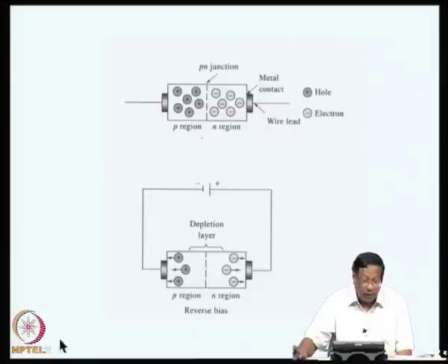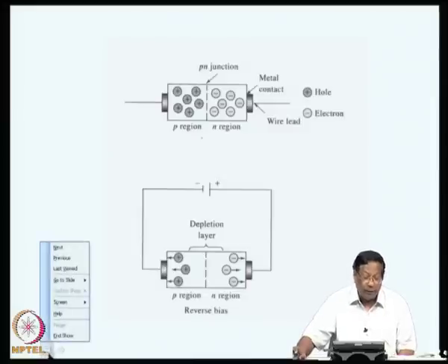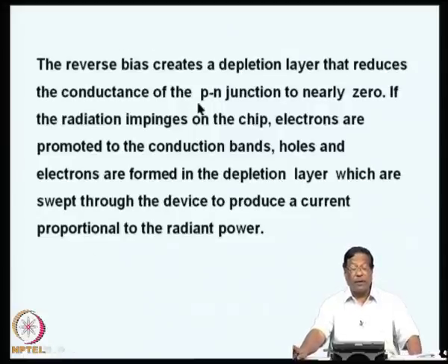Now, when radiation falls on it, electrons and holes will be generated, and the current will start flowing. Suppose the reverse bias is applied, then the electrons are promoted to the conduction band and holes and electrons are formed, which are swept through the device to produce a current proportional to the radiant power.